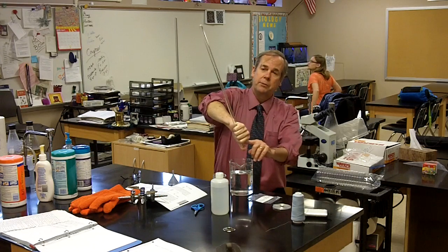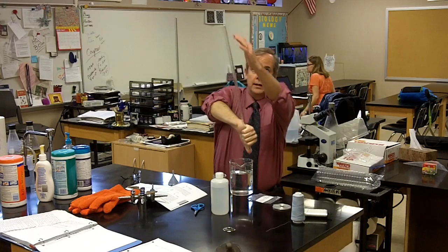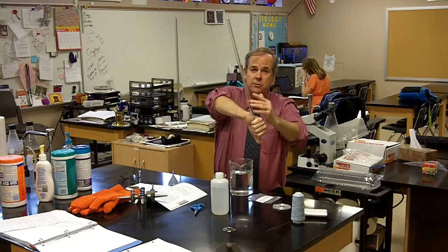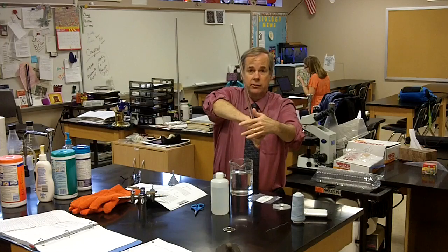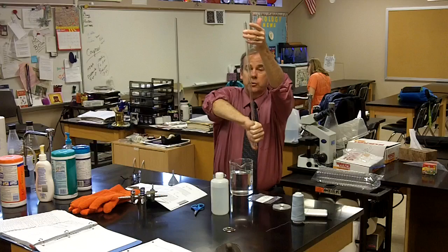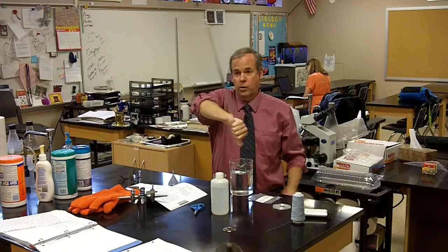So the magnesium will end up at the bottom of the tube. The acid will be at the top of the tube and as it drifts down because it's denser, it will begin to react with the magnesium. Gas will form and the gas will rise to the tube and we will collect it over water.